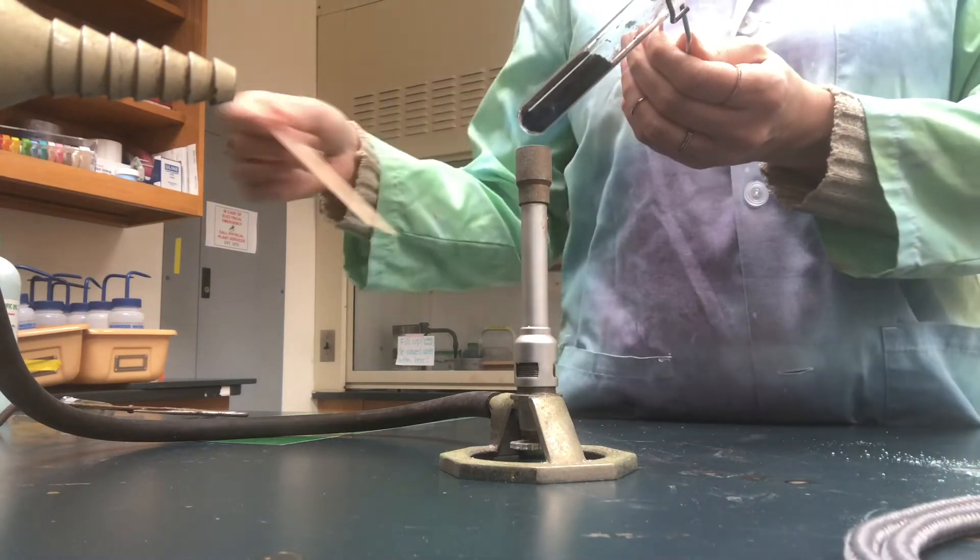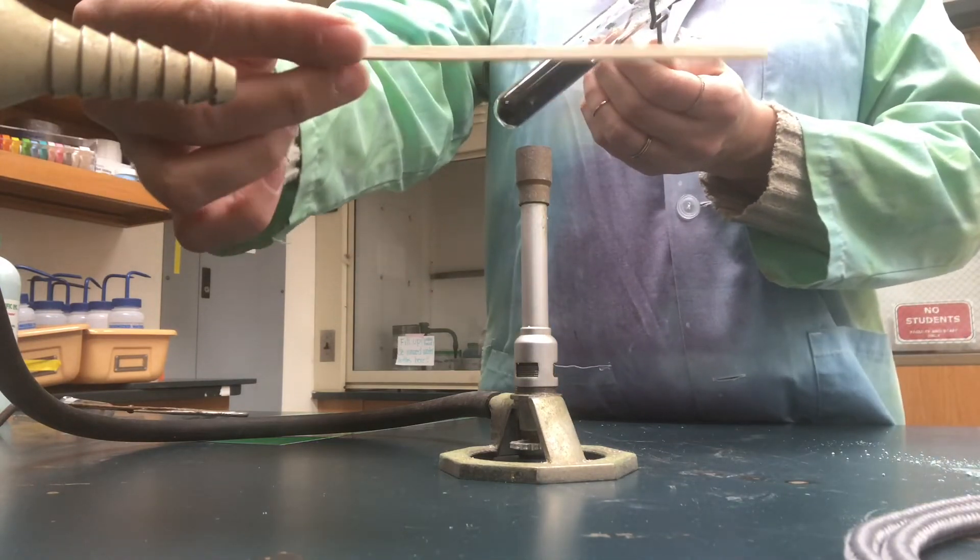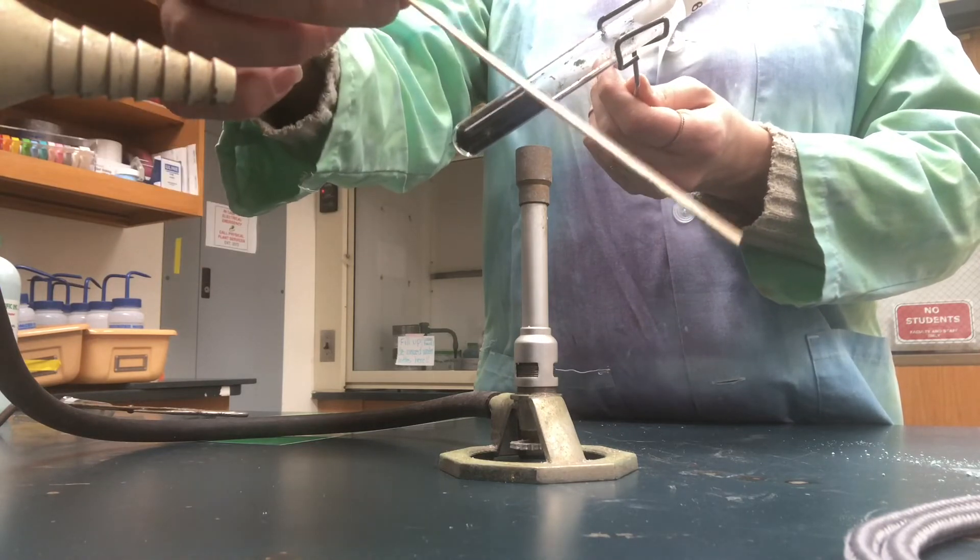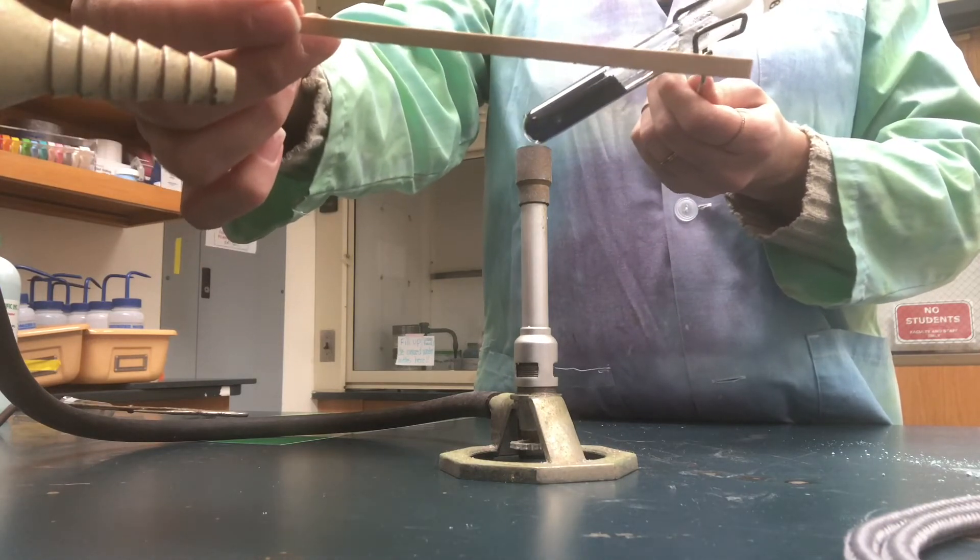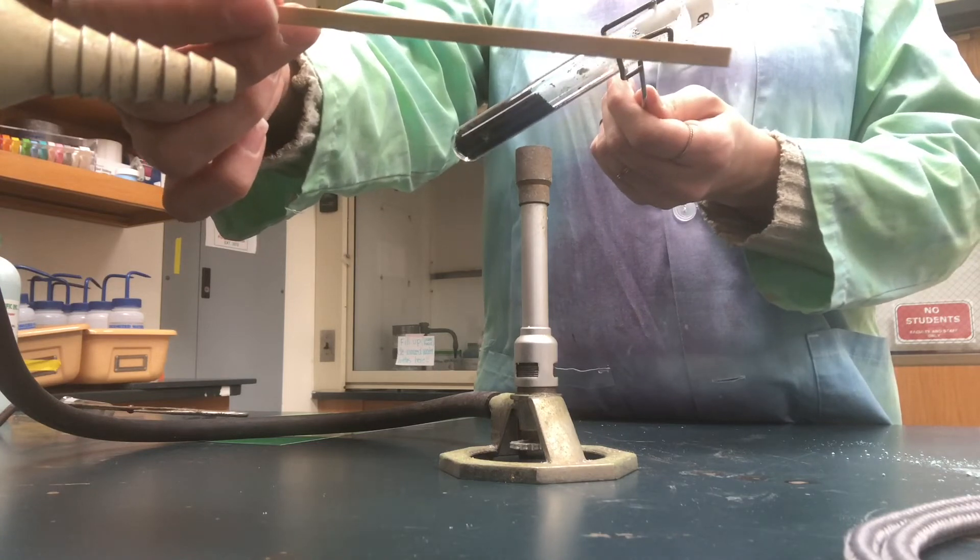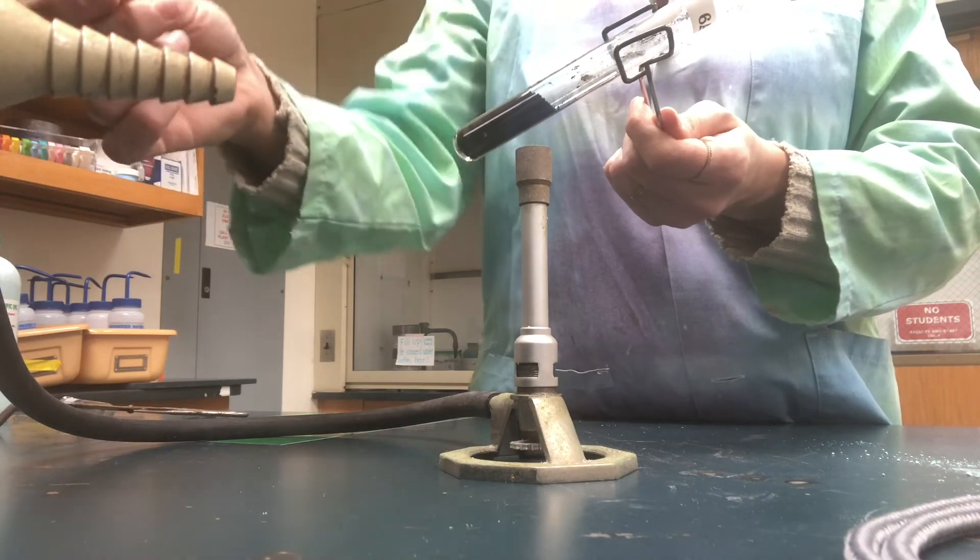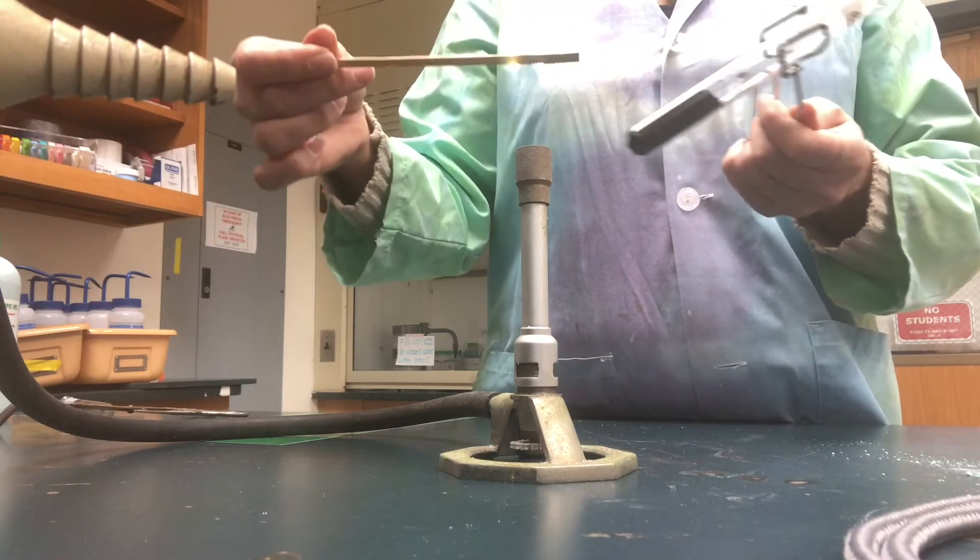This is the wooden splint that you use to check for the presence of a gas. It looks just like a coffee stirrer. Actually it is a coffee stirrer. It's just a piece of wood. I'm going to take the wood and light it on fire.